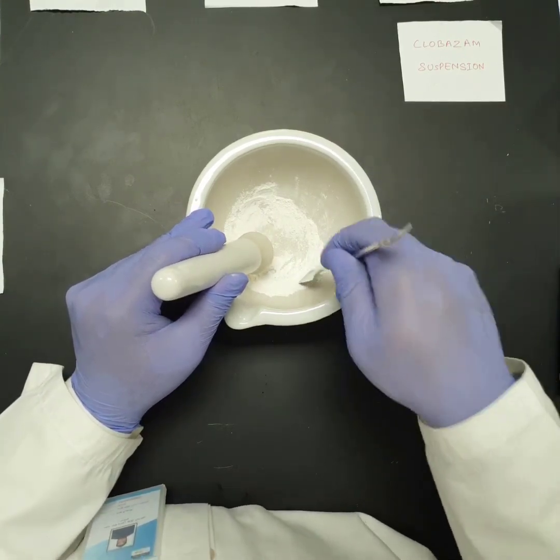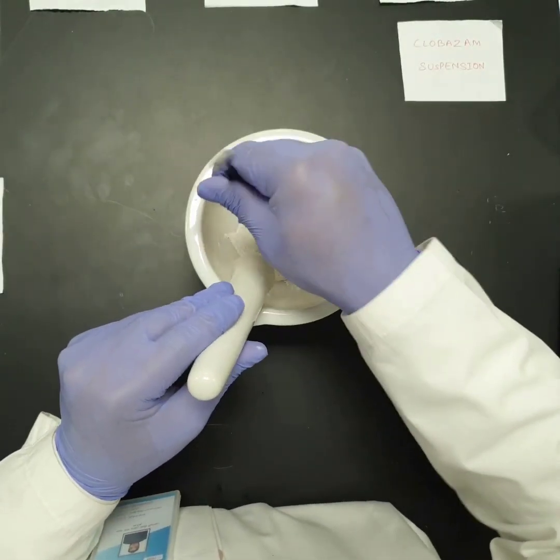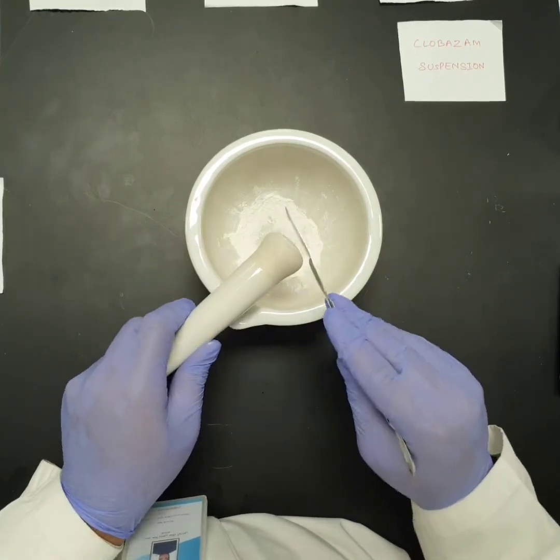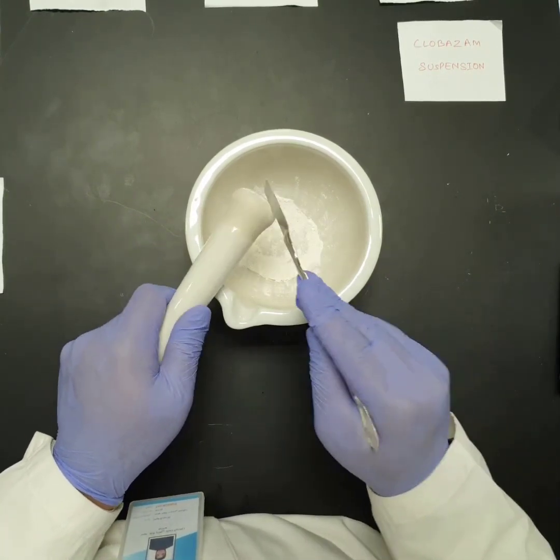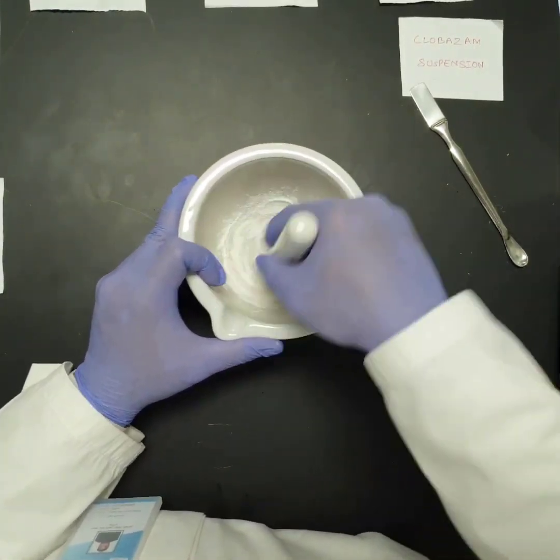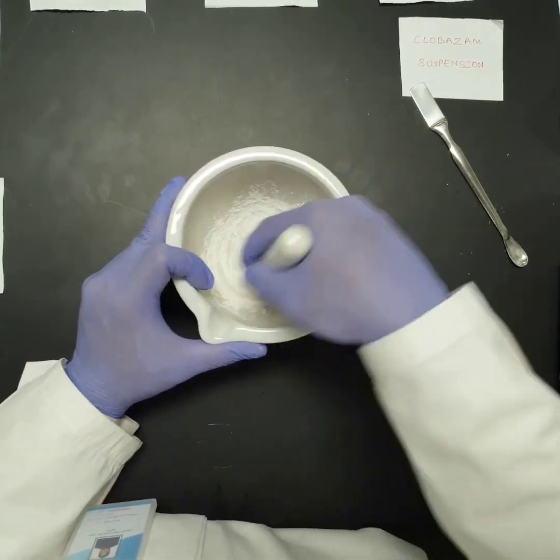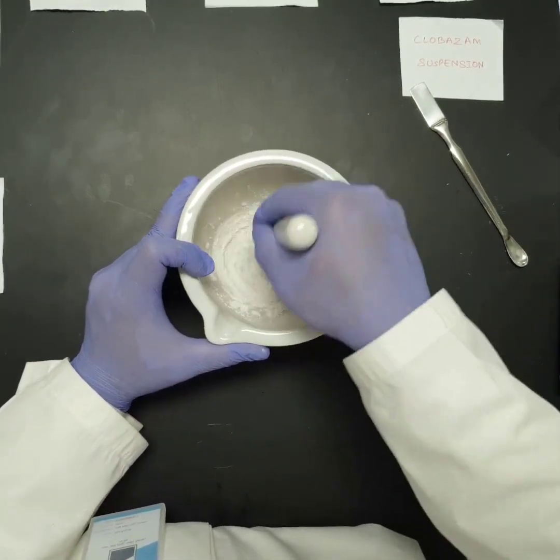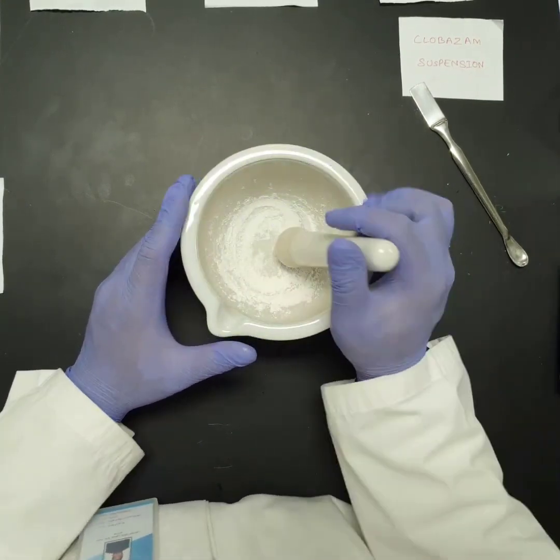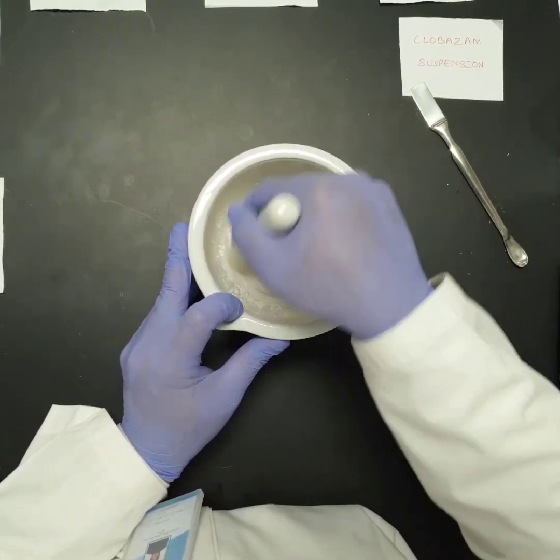Remove any powder from the walls of the mortar, or from the pestle. So now these two powders are mixed evenly and they have become a fine, smooth powder. So it's time now to go to our next step.